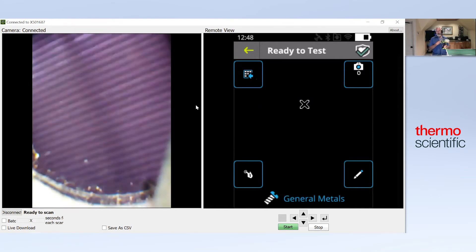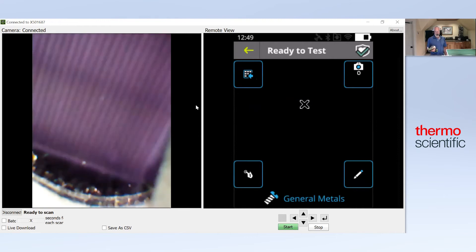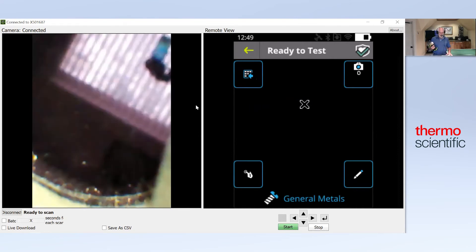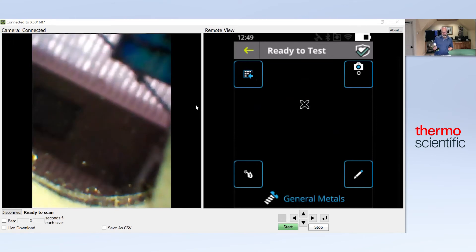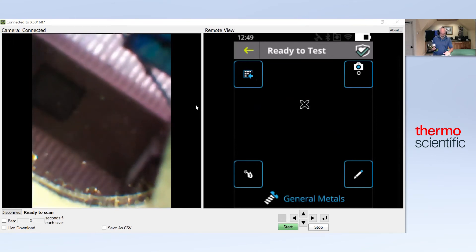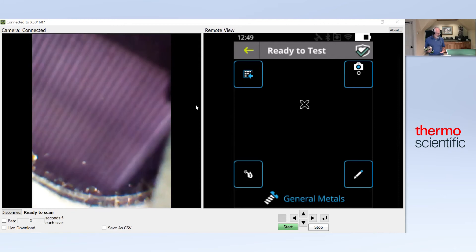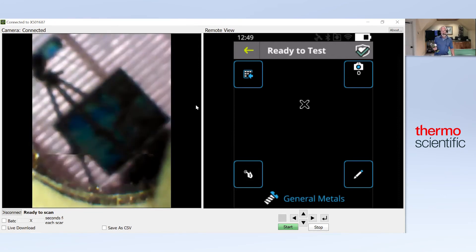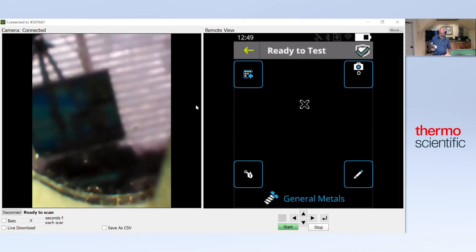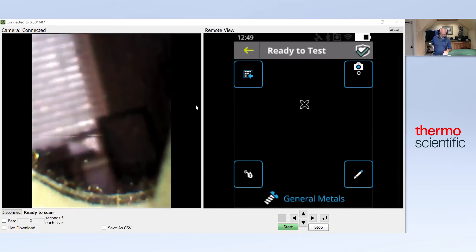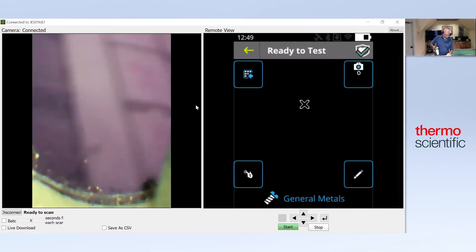There's two libraries in this analyzer. One is called the factory library, and because the factory library has so many varieties of aluminums and those varieties are so close together, what I've done is I've set up what I call the common aluminums in the library so that you can do quick sort with the main filter and not have to use the light filter for most everything you're after in the common range. If you have something that isn't in the common range, just switch to the factory library and it'll pick up those others. Let's start with the three aluminum alloys most people are sorting and have most trouble with because they're so close in chemistry.